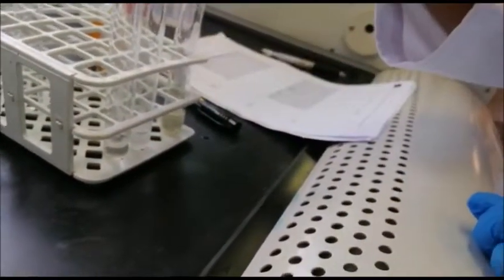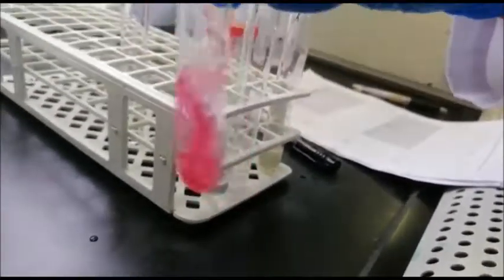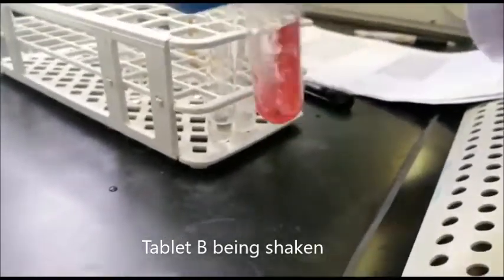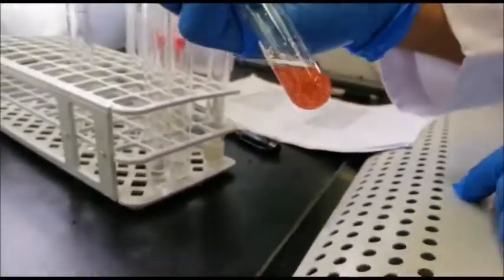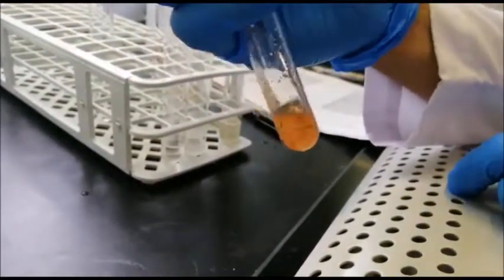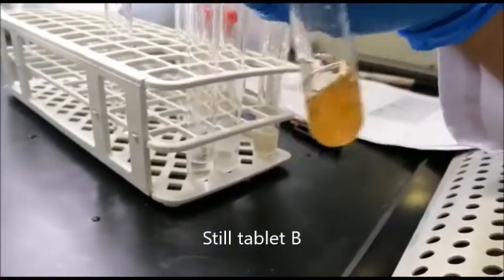In a retest, we managed to achieve a negative result for tablet C, with the KMnO4 remaining purple, hence tallying with our predictions. Second, tablet B, when reacted with KMnO4, did not yield any color change. After much shaking of the test tube, it turns red, then a dark orange, and then a yellow. However, after a retest, we achieved the prediction of a positive test result for tablet B, where KMnO4 decolorizes.